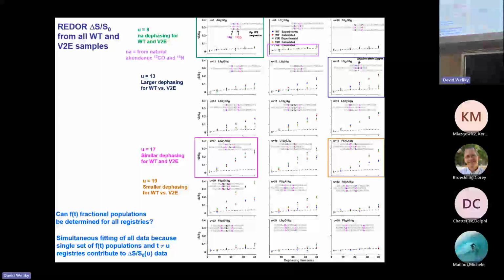We had these data for a long time. I worked on the analysis on it. Then I was very fortunate to have a new PhD student, Yijin Zhang, who was interested in programming and fitting, and she taught herself Python code. I always knew my goal, really the important goal of the data analysis, was to determine these fractional populations for different registries T.